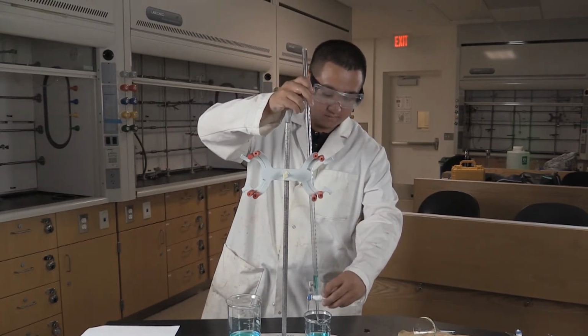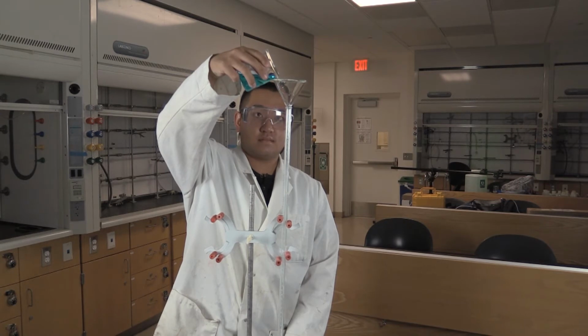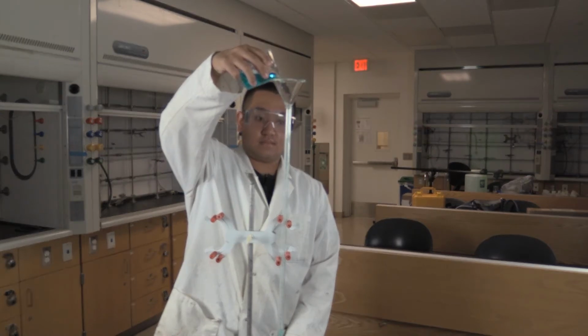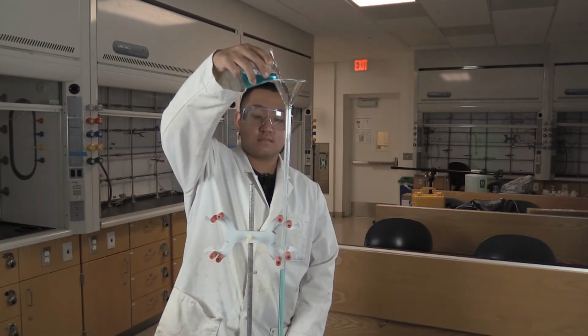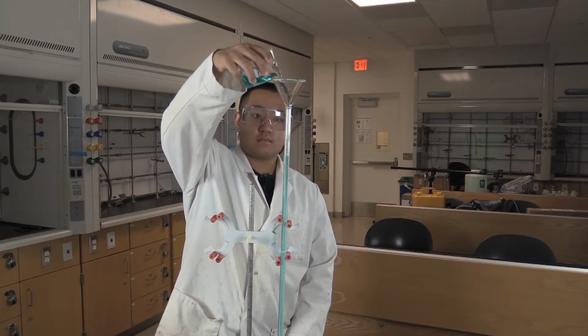Now you're ready to fill. You can use a funnel or not. And here's a pro tip. When filling your burette, be sure to move your analyte flask that contains your solution away from the bottom of the burette. That way, if you spill any of the solution you're pouring into the burette, it doesn't contaminate the analyte solution. You don't have to fill up the burette all the way to zero.